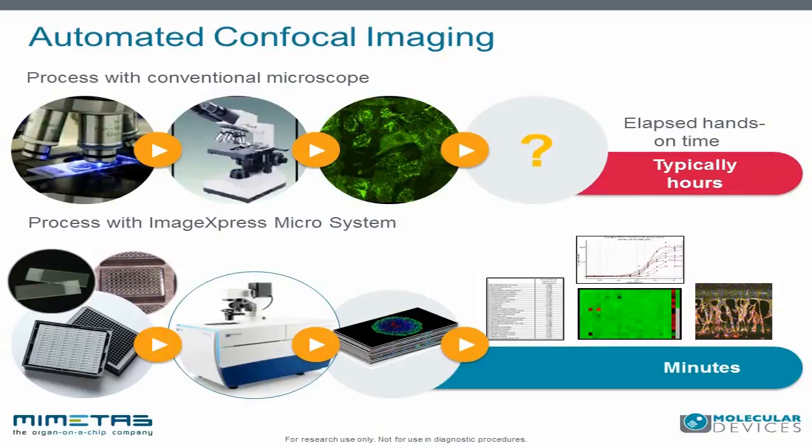Mimetas is going to present how they transitioned a 3D organ-on-a-chip assay from an automated standalone microscope to a true high-throughput system using their OrganoPlate platform.